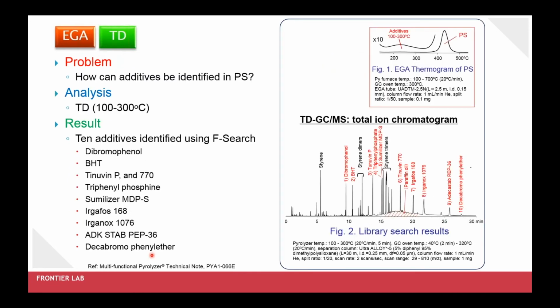In this case, our thermal desorption gets more complicated. So obviously the last one was a very easy example just to introduce thermal desorption and to introduce how we find the temperatures to use. So in this case, we're going to be looking at more challenging additives. You can see them over here on the left. These are common additives for a variety of purposes that are present in a wide range of polymers, and they're much larger. They have some polar functionalities, and so they're more challenging.